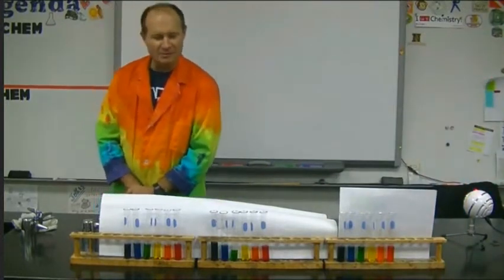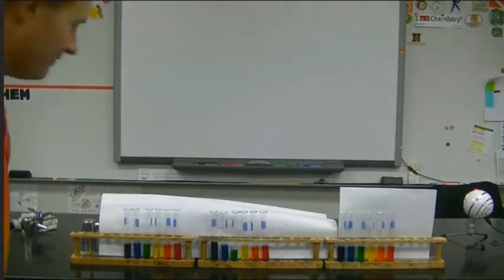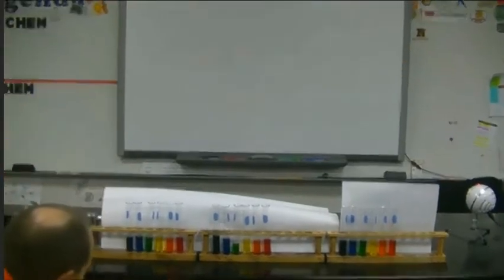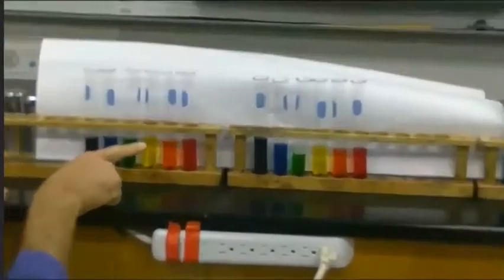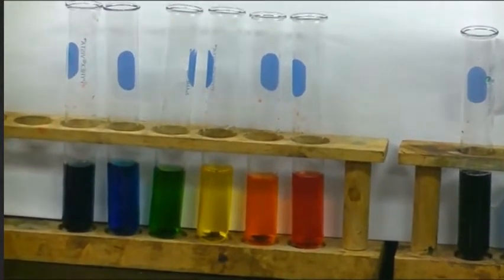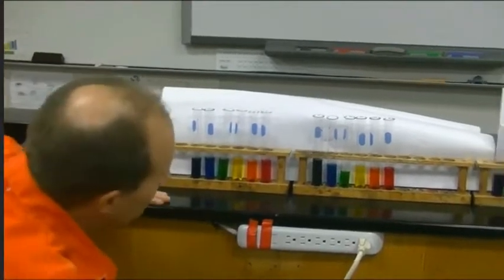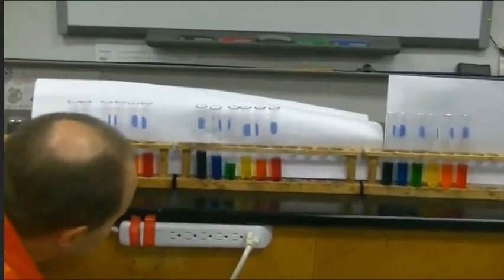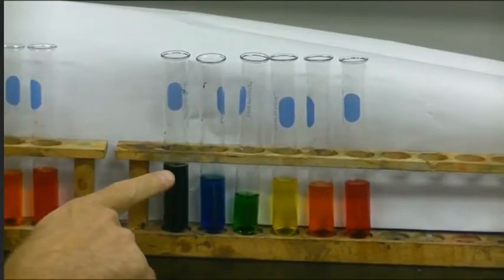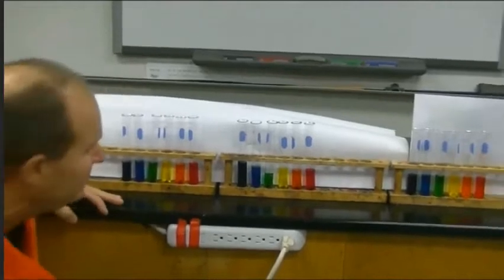Okay, well, let me come around to the front here. Very nice. I see we've got the whole rainbow. Now, I look at this and I see a little bit of a difference in levels here, indicating that somebody's skills are just not quite what we want. Let's take a look at the person in the middle, whoever that is. Holy stair steps. I don't know what happened here. Did somebody drink the green Kool-Aid or what?